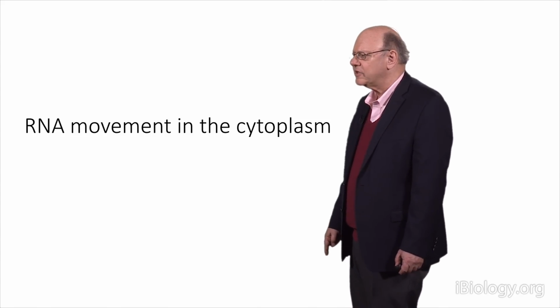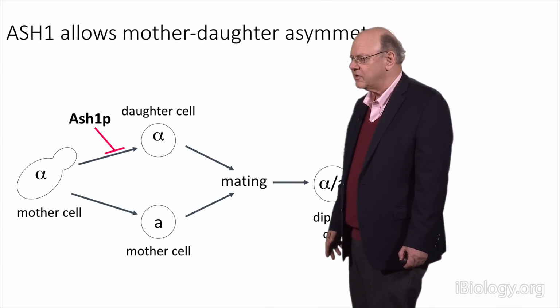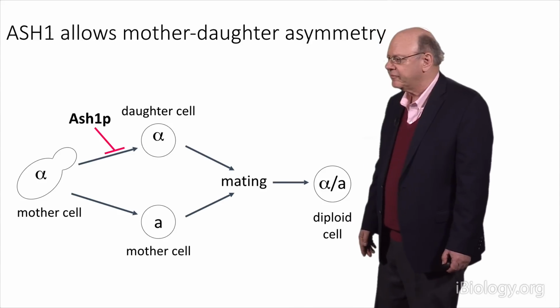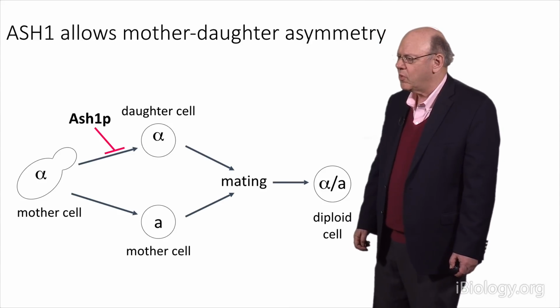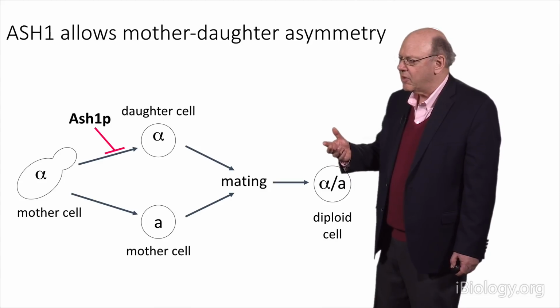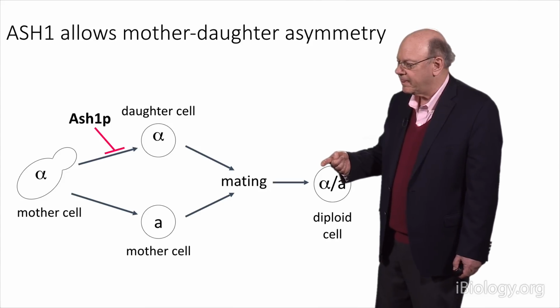Okay, now once RNA gets into the cytoplasm, it's a completely different story. It's no longer diffusing that much. And I want to show you once again this localization of RNA that allows the RNA to actually engage in changing the switching of a mother and a daughter cell.